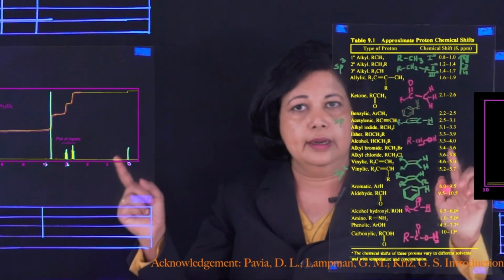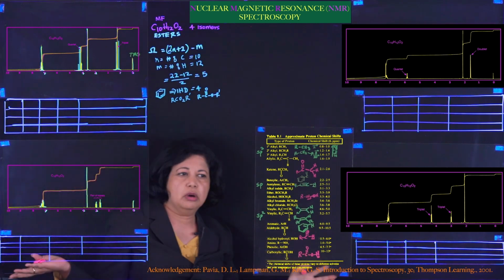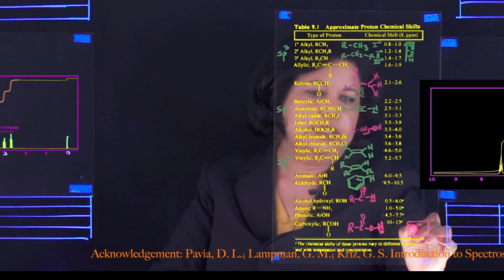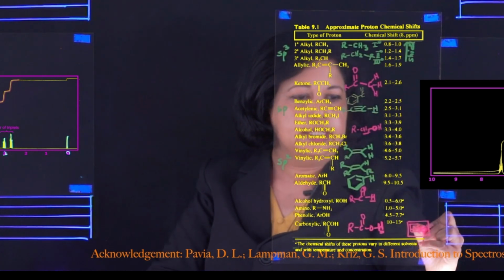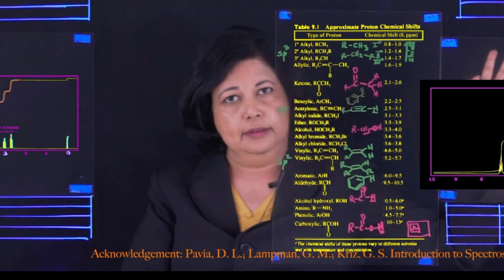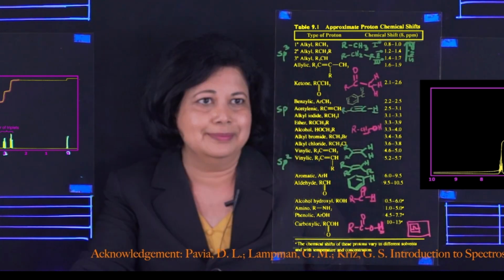So now the NMR scale is 0 to 10. So how does it draw a 12, let's say? What it does is it puts an inset. So they'll have an NMR, and then you see a small box inset, and then there it's going to say, well, 12 ppm or whatever, there is a peak. All right, so it's off the scale, literally. Okay, that's why we have to put it in a separate box.